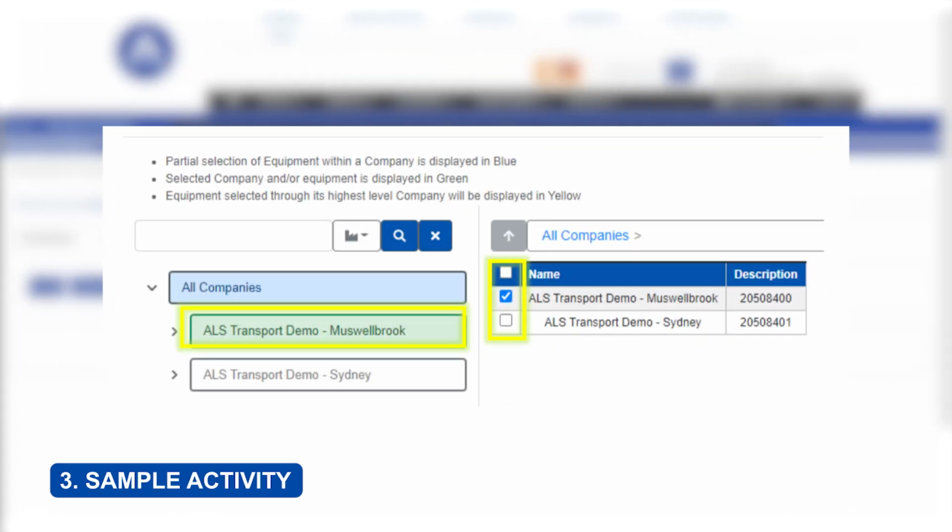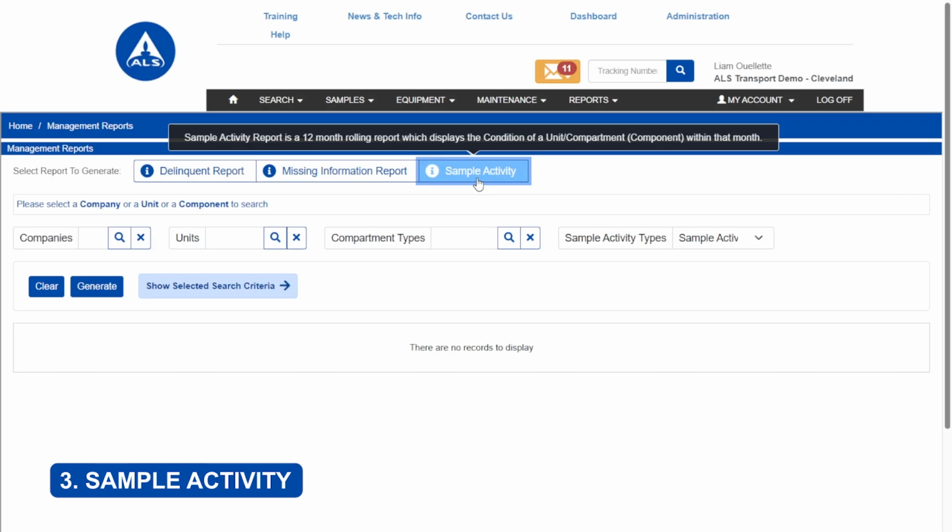A list of all accounts for the user is displayed. Click on the desired account name. Selection may also be made by using the checkboxes. To generate the list, click on the Generate Action bar.